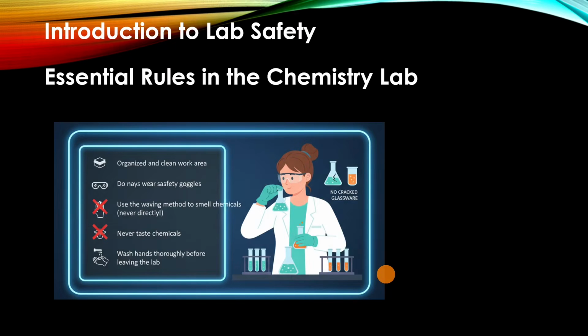So now let us look at introduction to lab safety. So we have now had a picture of what can happen. As much as we know the importance of chemical industrial activities, now we know their negative impact also. If we know the negative impact, then we can intelligently make decisions to avoid those. Okay. So having looked at that, now we move to introduction to laboratory safety.